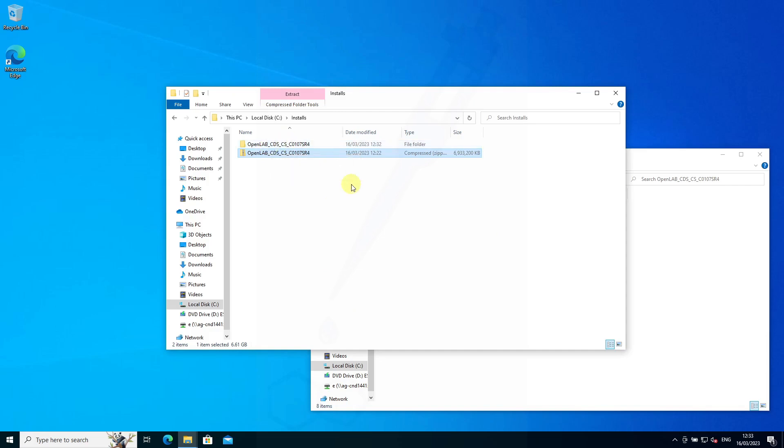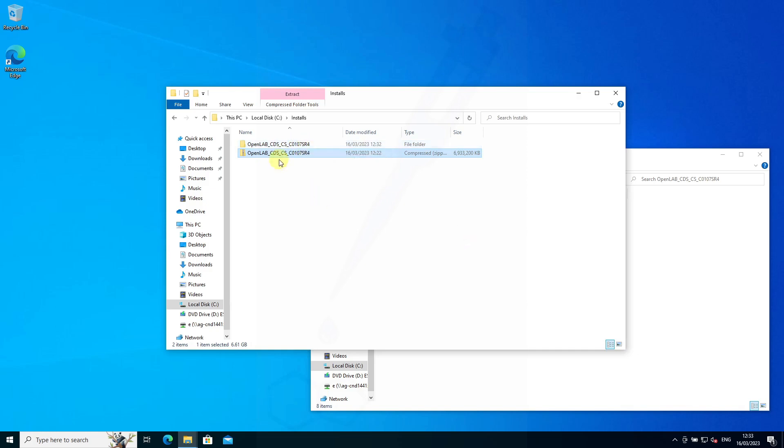This is how to install ChemStation CDS version 1.07 service release 4.